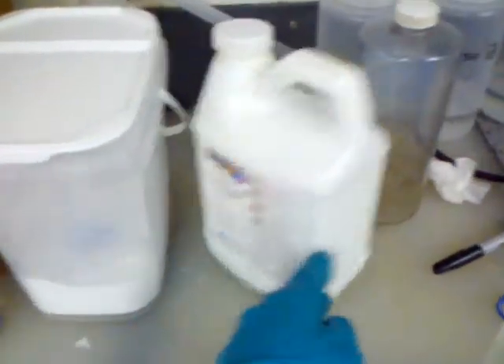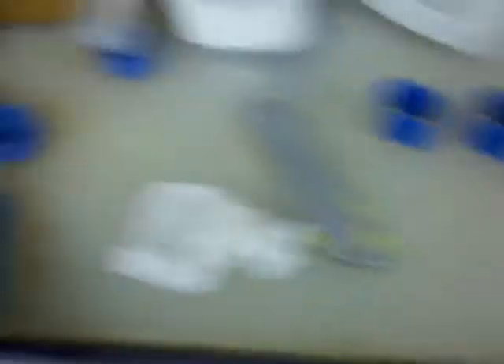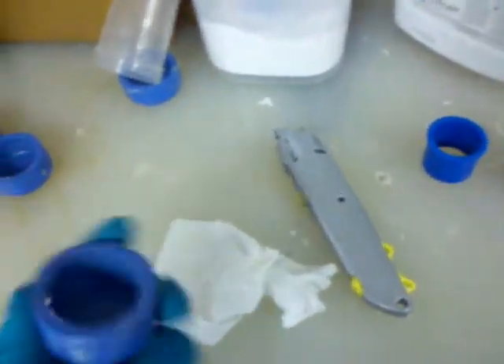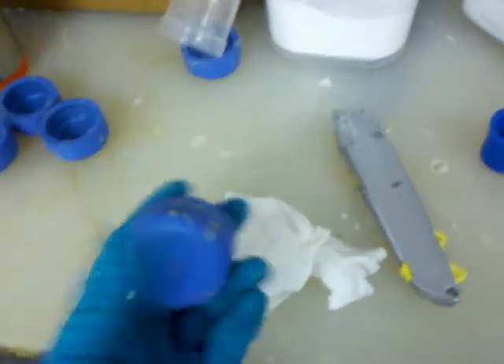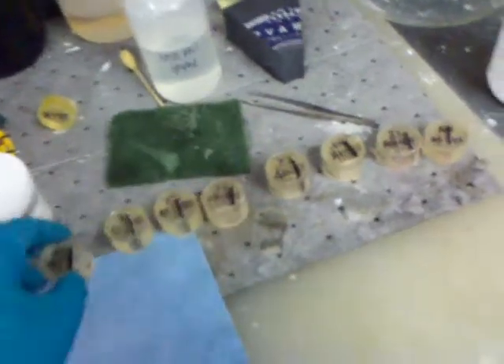I actually have to saw this in half again on the diamond saw. After that, I bring back the little chips and make them into little molds. There are two ingredients for the acrylic we use — it's a powder and a liquid. I started using these molds and doing them one at a time, but with 720 samples that really takes forever. So just this week I've been working on a method to group them, and here you can see five in there at once.